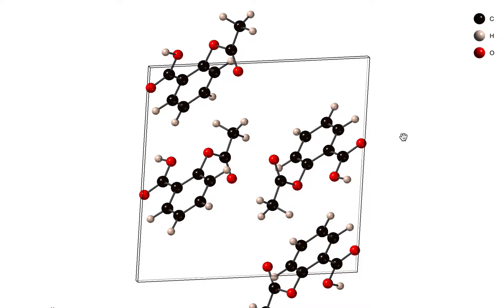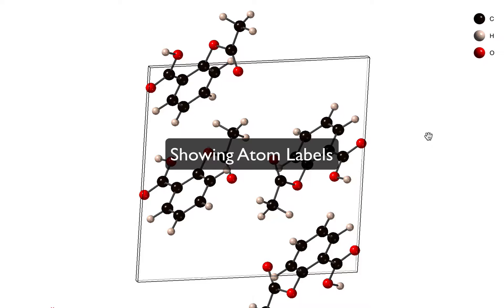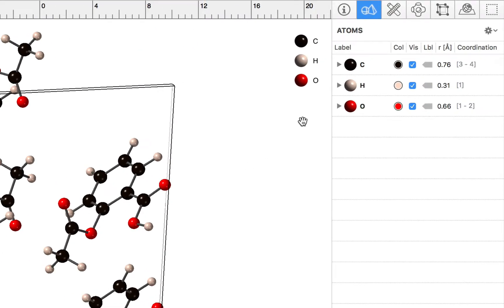Now the next thing we're probably going to want to do is start measuring this molecular crystal, and something that's quite useful is to display labels for the individual atoms. We can toggle labels on or off by element using the atoms inspector.